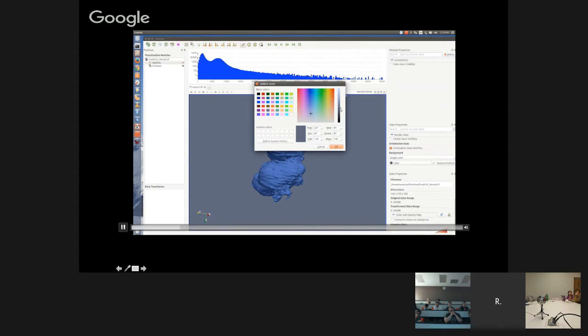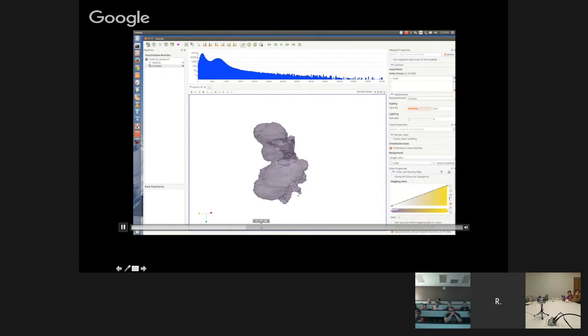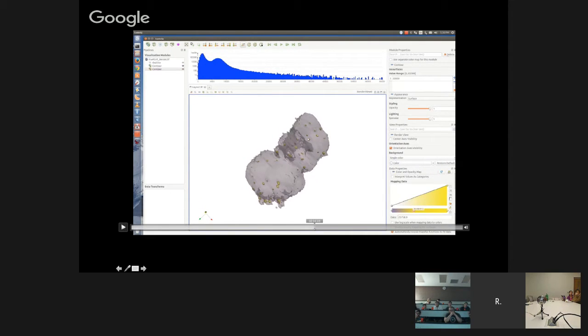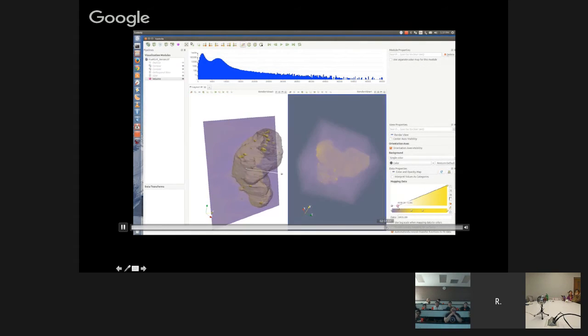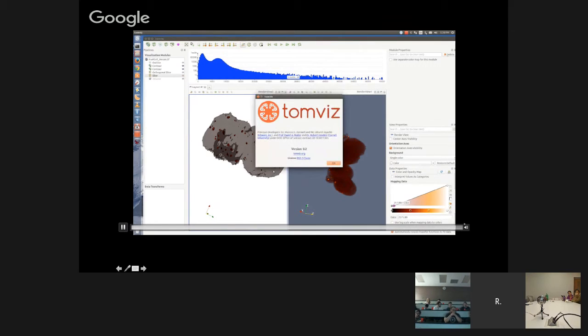Right, so all the standard stuff. Speed this up. I think this was not the same video that I intended to show. But yeah, you can do volumetric rendering, you can do surface rendering, you can slice it, you can do Fourier transform analysis. I apologize, this wasn't the complete video.